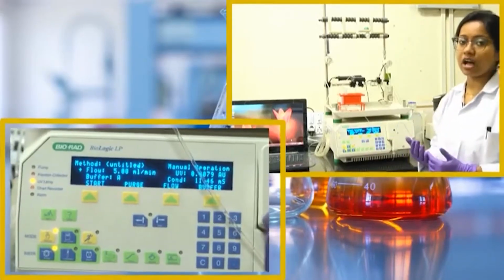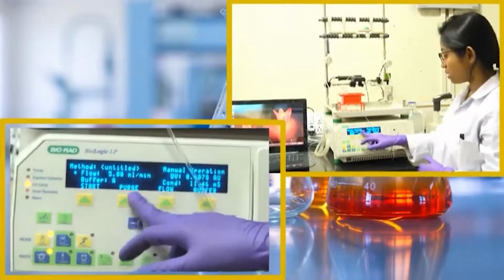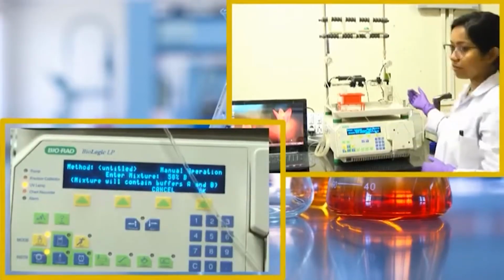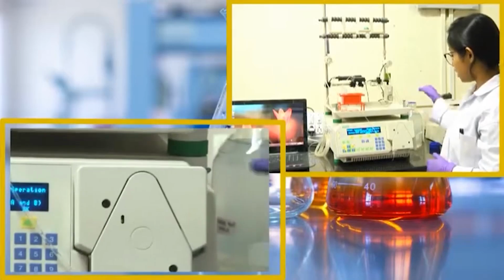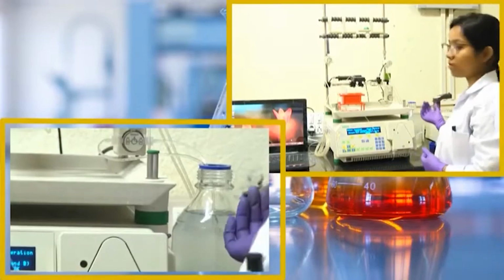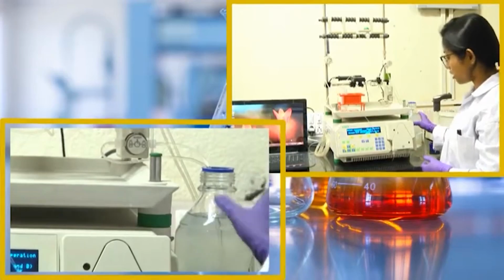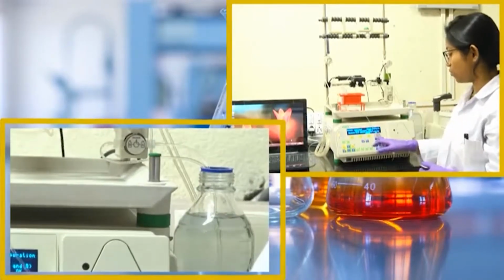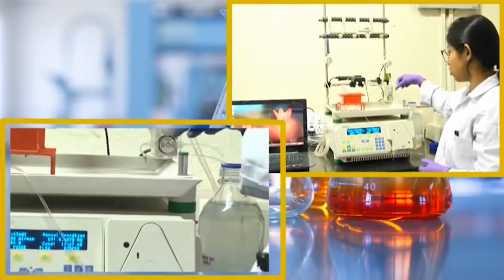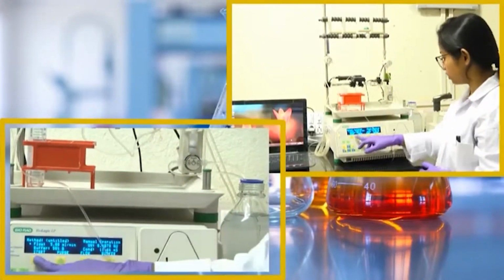Flow is also dependent on pressure. If you go for a higher flow rate, the pressure might increase and it can damage your column. So, this column can withstand 5 ml per minute, and for buffer we are giving mix. We want buffer A and buffer B both, so we have put the two channels in the same container. You can put them in different containers, but we want to run water through all the channels. This container contains only milli-Q water, so we will go for mix. It will take water from both tubes, mix it, and channel it through all the tubes.